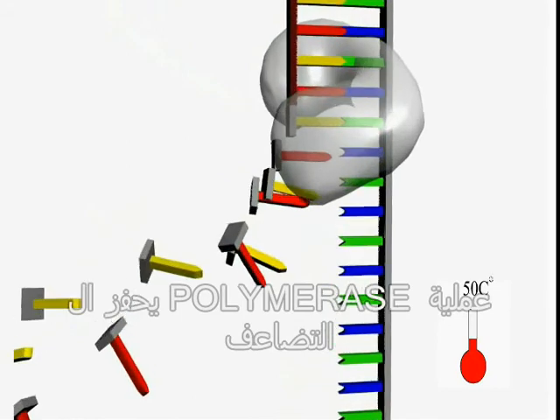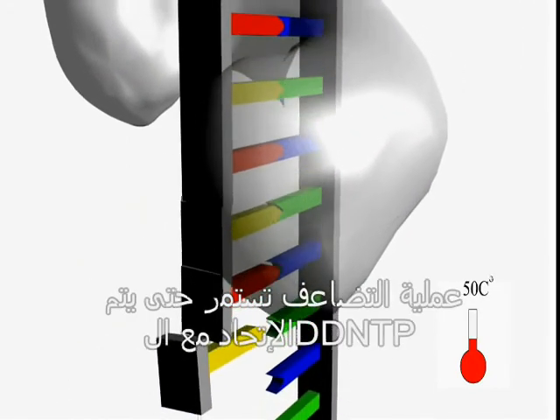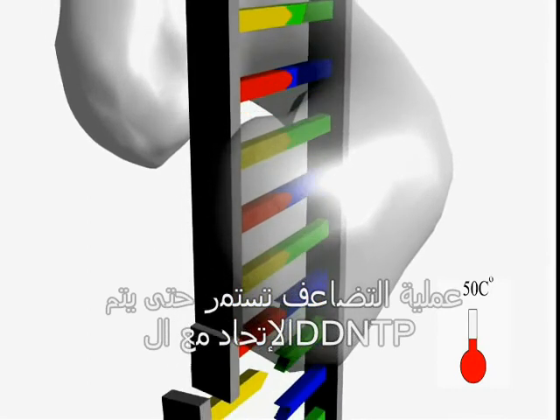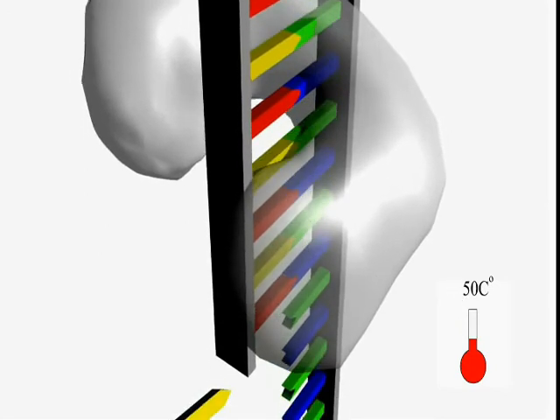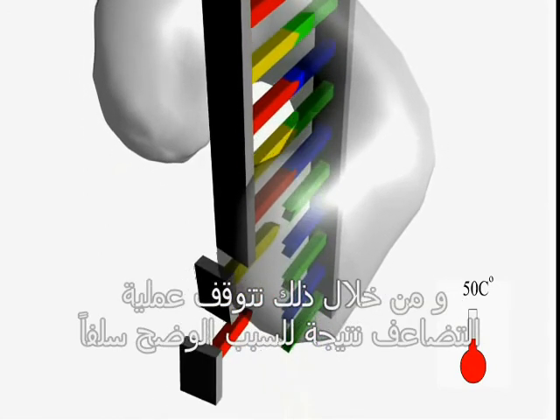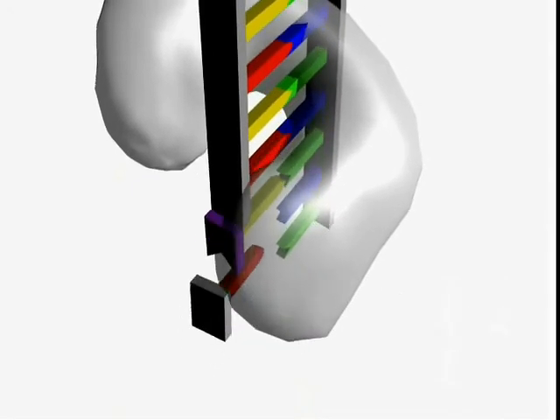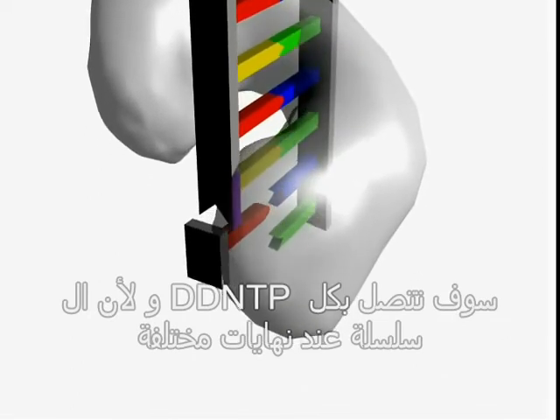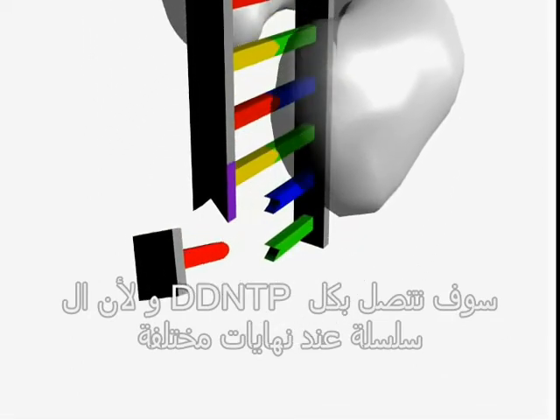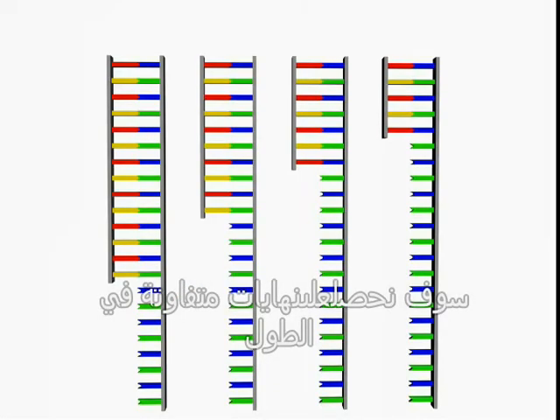The polymerase catalyzes the replication process, and this replication continues until the ddNTP molecule combines and halts the replication for the same reason we discussed earlier. And because the ddNTP will attach to every chain at different locations, we will have different lengths of chains, which can be separated according to length.